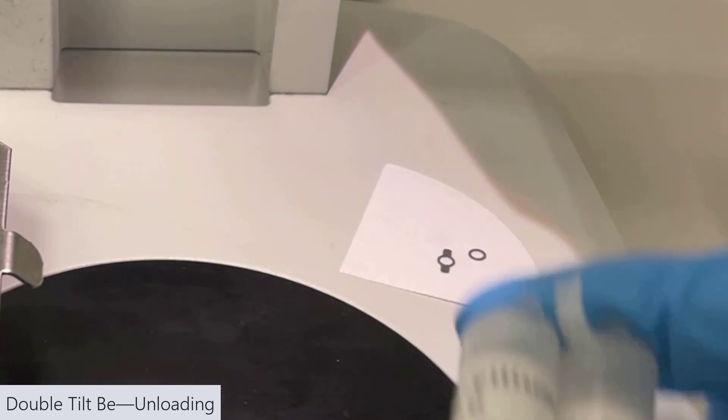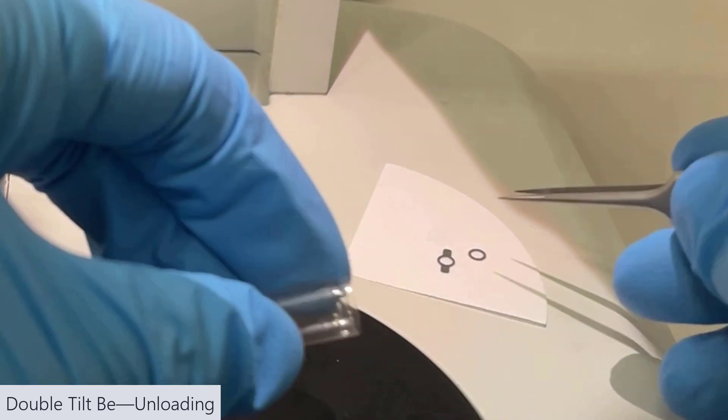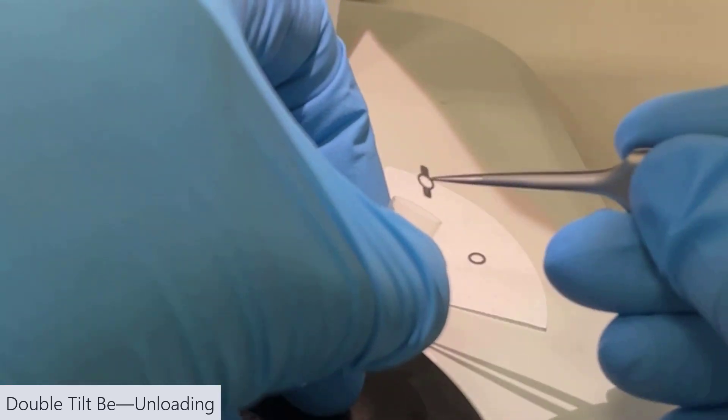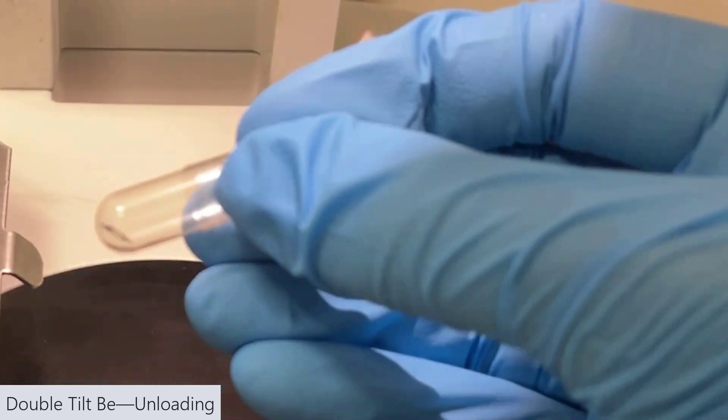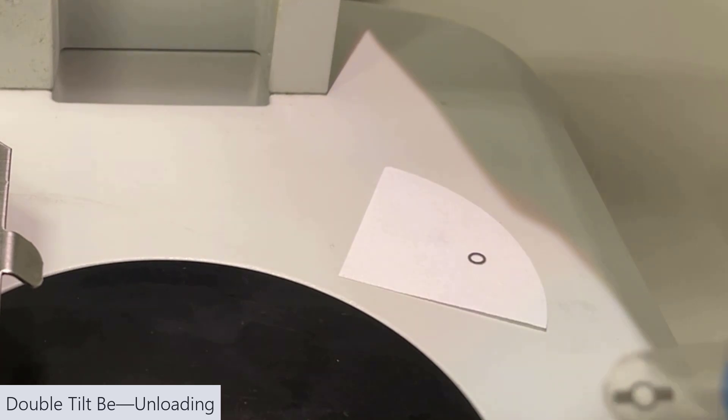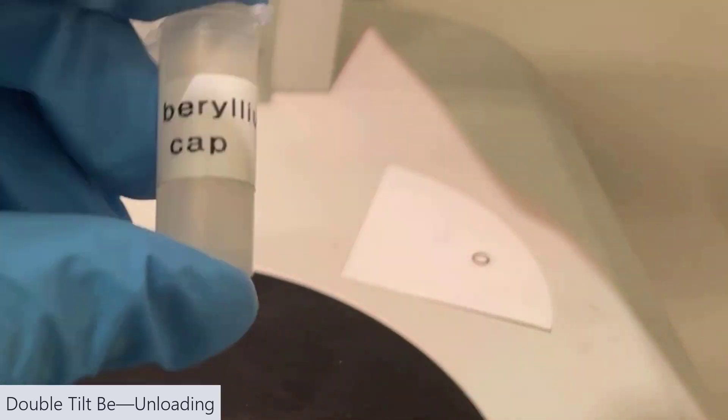For our lab, we actually keep the beryllium spacer and cap in these little gelatin capsules. That way, we don't risk them falling out in a vacuum pump that we use to keep our sample rod in at all times. So I'm just putting the beryllium cap back in its little gelatin capsule and then its container and then the beryllium spacer as well.